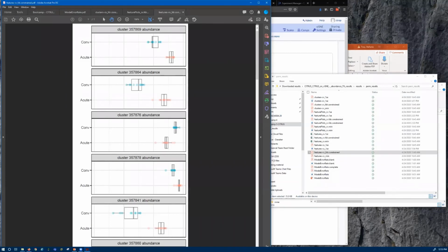All right. What is the minimum number of events sampled per file for Citrus? And is a number below 5,000 events reliable? Junjun, do you want to tackle this one? Sure, I'll be happy to take that one.